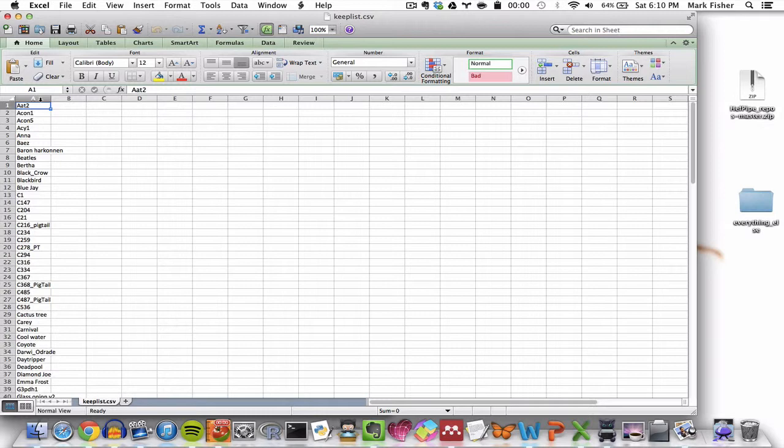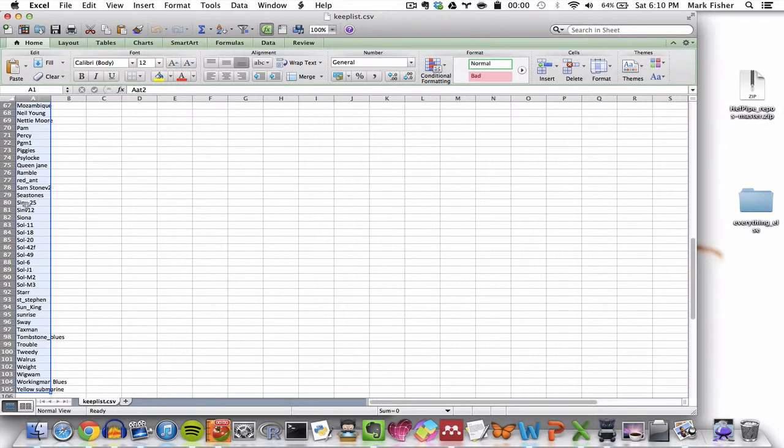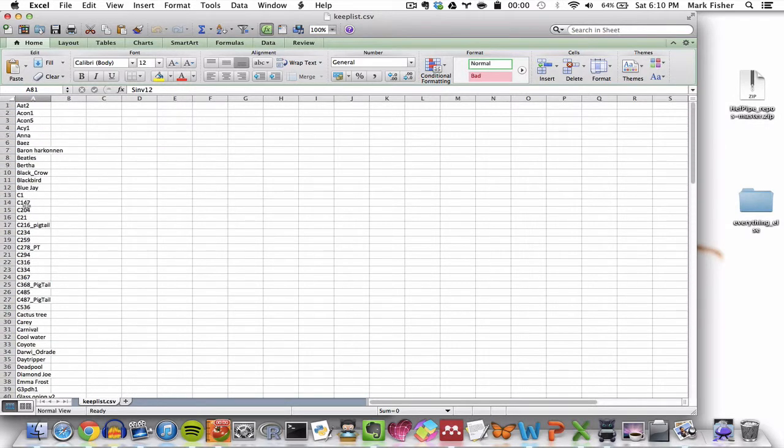The HeFPipe pipeline will throw errors and arrest if a locus with no polymorphism is included in keeplist. So unless you're actually looking for a convenient way to identify loci without polymorphisms, don't include loci without polymorphisms in keeplist. But that said, it is an easy way to find loci with no polymorphism.